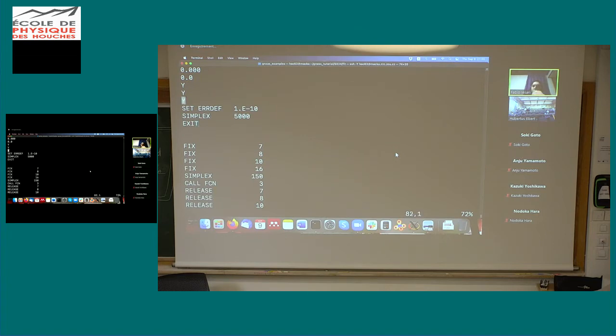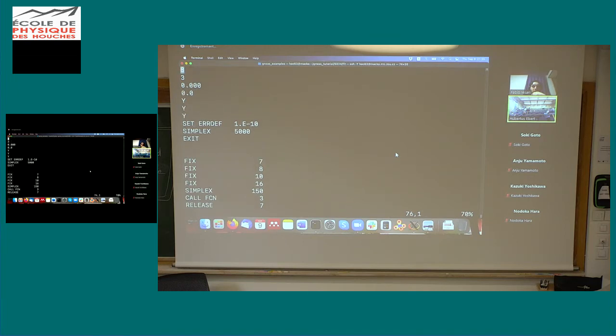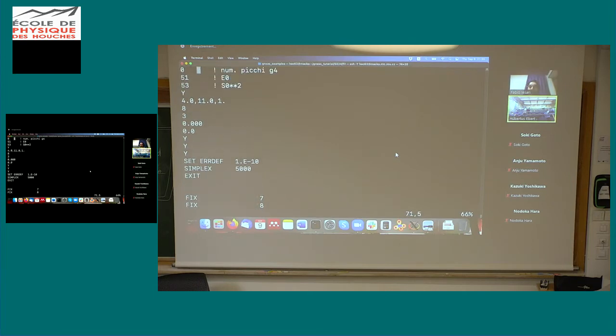Fabio? Yeah. In the file itself there is a parameter called MFP, which I understand as mean free path of electron. Yes. That appears to be 0. Could you comment on that aspect, please? Yeah. As I said before, in our calculation we use the complex potential. When you use the complex potential, the mean free path effects are already taken into account, so you don't need to put a parameter.